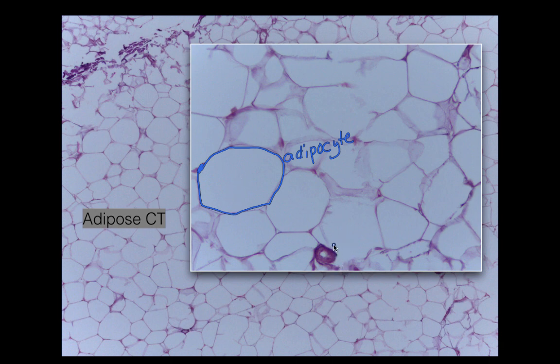For the Grossmont or Miramar students who need to know this: here is our blood vessel, which looks very different from the adipocytes. SDSU students, you don't need to know that. The blood vessel you can see is wrapped in smooth muscle — that's how you can identify it.